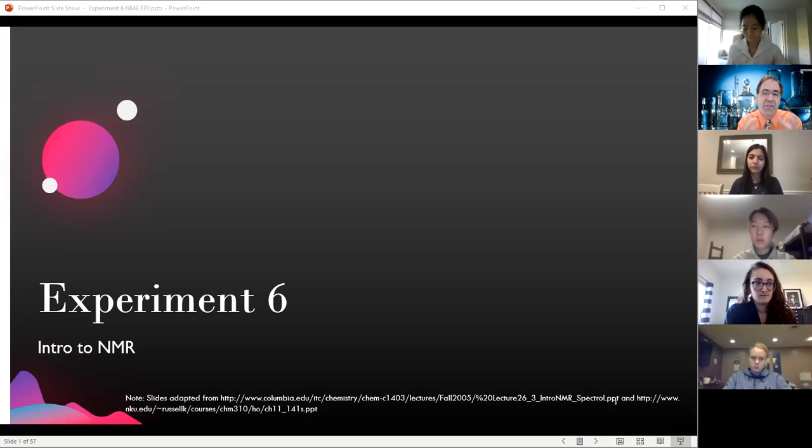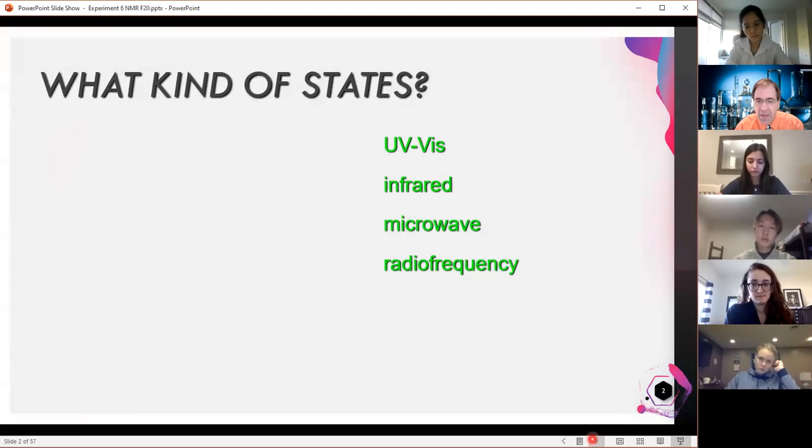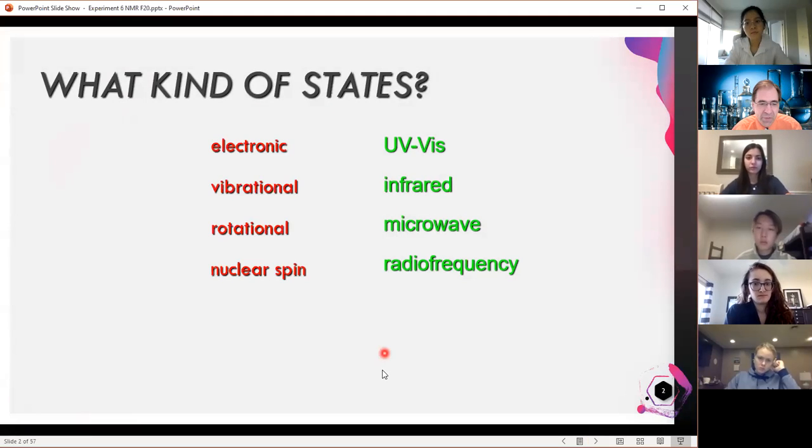So we're going to see, we get a signal in an NMR. So you get a peak, and that peak actually has a lot of information. It tells you, for instance, how many hydrogens you're looking at, and something about the electronic environment it's in, but it also tells you about what hydrogens are one carbon away. So for the first time, we have a way to look not just at a proton, for example, but one carbon away and find out how many protons are there. So we can start to make connections between the molecules. So we'll go through all of those things. We'll talk about what's happening with it as we go through, but just wanted to give you a little bit of heads up.